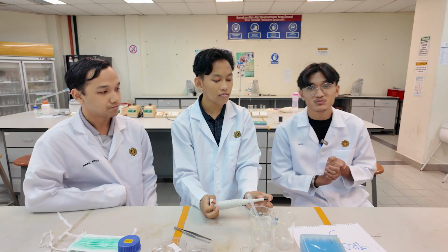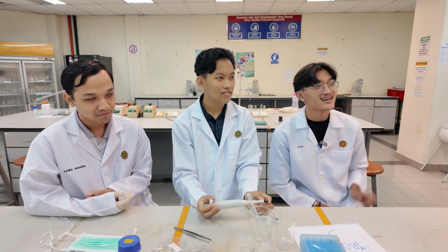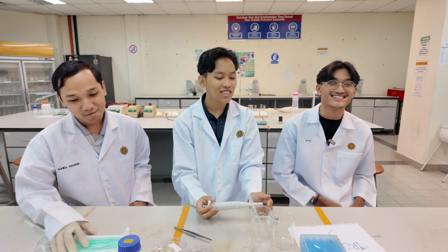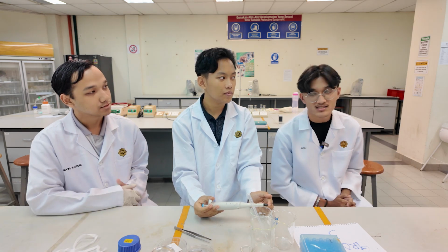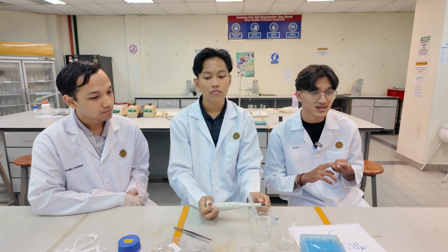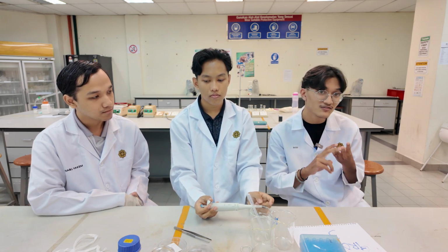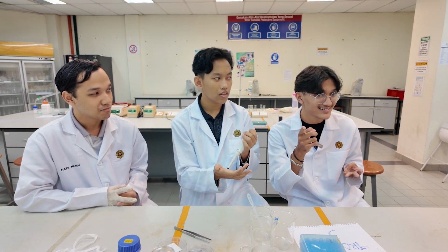Okay, we move to the interesting part, which is, who knows? Industrial. Yes, smart. The industrial part. Okay, for the industrial part, why do we use TLC in industry? First, I will give three examples: the pharmaceutical industry, the food industry, and the cosmetic industry.